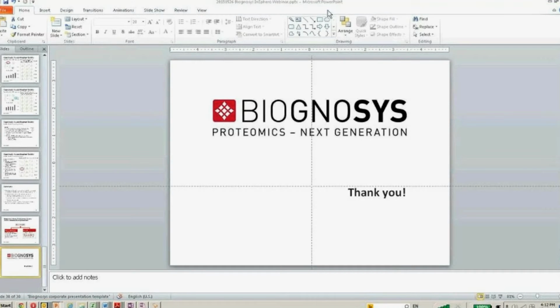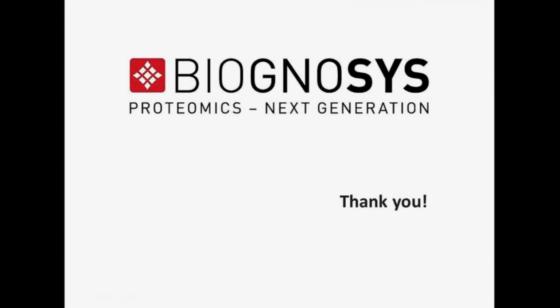Thank you, Oliver. One quick thing I wanted to clarify is that each data point, each time point, was generated for each concentration of acetaminophen treatment, and that was done with 12 microtissues. Is that what you said? One row of a plate of microtissues, so you could get 8 replicates or 8 different doses on a 96-well plate of microtissues, and that's correct. Yes, protein material suitable for analysis with the HRM-MS. Yes, that's correct.